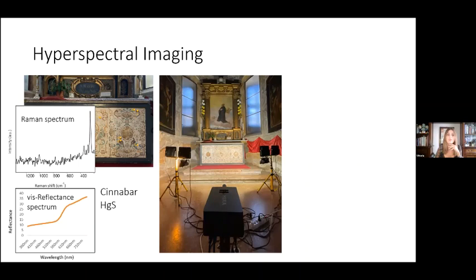During the first measurement campaign on the frontal, it was decided to focus the study on red pigments. Raman measurements allowed recognizing cinnabar on some of the red decorative plants, motifs, and the bird's wings. Conversely, on the red area surrounding the restored part on the left side of the altar, some red ochre was found. All Raman spectra also showed the peculiar bands of gypsum. Visible reflectance measurements performed on the same area confirmed those results.